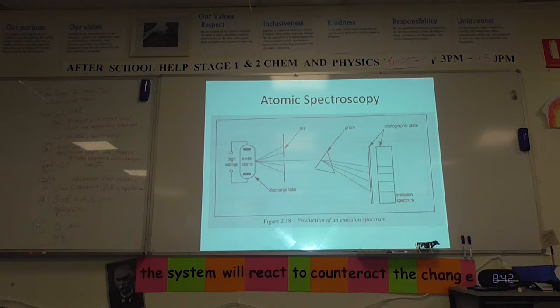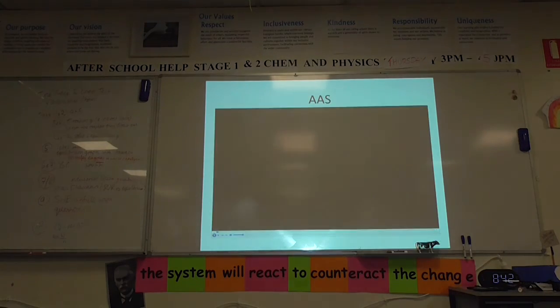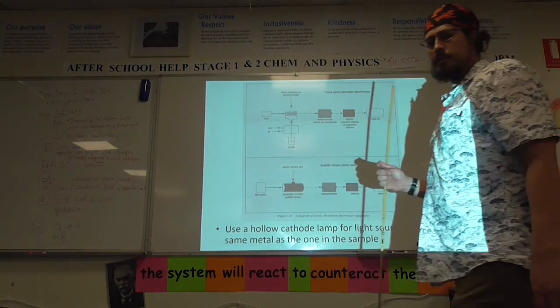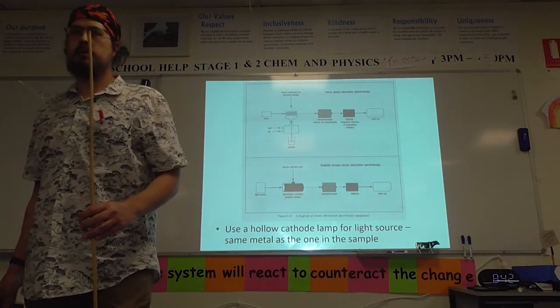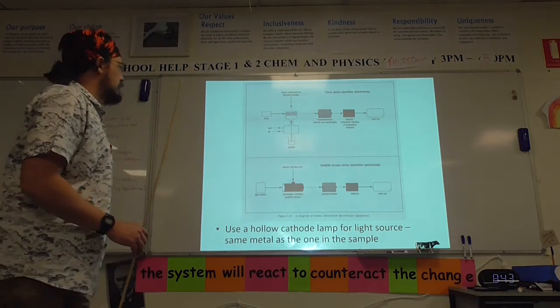Okay, here's a very, very basic setup of an emission spectrometer. We're interested in the absorption spectrometer. Now, where is it? Yeah. Okay. There's a couple of key things that you need to know because you could get medium response questions about it. Like, there's no extended response anymore. That doesn't exist.